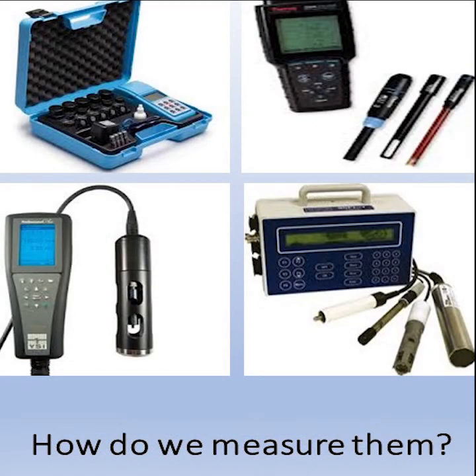There are many different types of meters that you can use to measure water quality. Some may be a multi-probe that measures all of the water quality parameters. Others may be a single meter that measures just one parameter. Other meters, like the turbidity, may involve collecting a water sample and then reading the results in the meter.